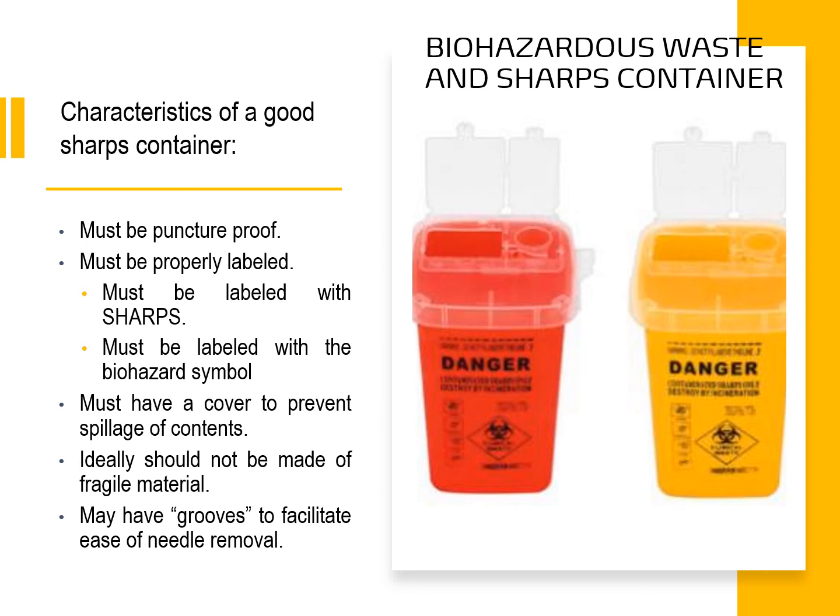In some of the sharps container, after collecting your sample, you need to just place the needle of the syringe at a certain portion of your sharps container, and then you just have to rotate your syringe and automatically the needle drops off inside your sharps container. So that's the purpose of the groove there.